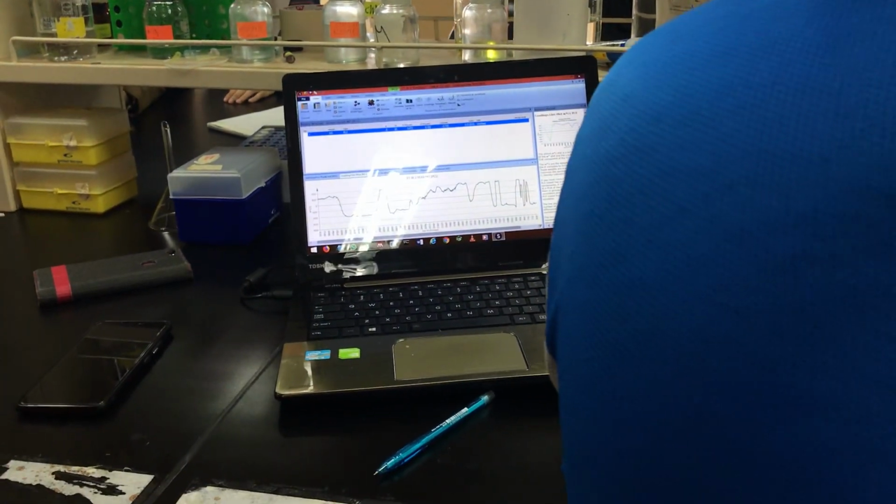Is it because of the nature of the product or because of error? No, not error. Some of the plants, even in the water extract, show high activity of antioxidants. This plant shows high activity even in water and in alcohol, because from 100% ethanol, methanol to 0% to 100% water, there is different polarity.